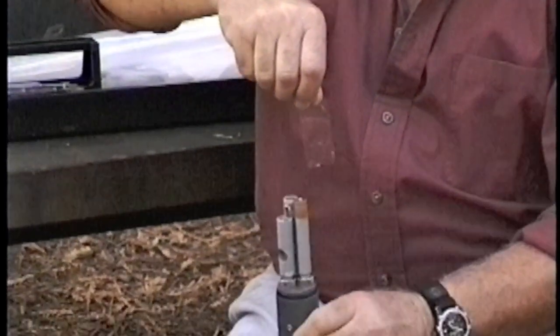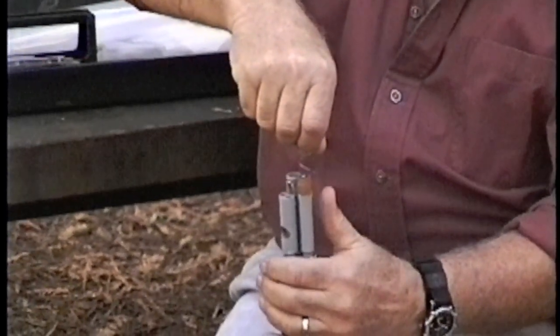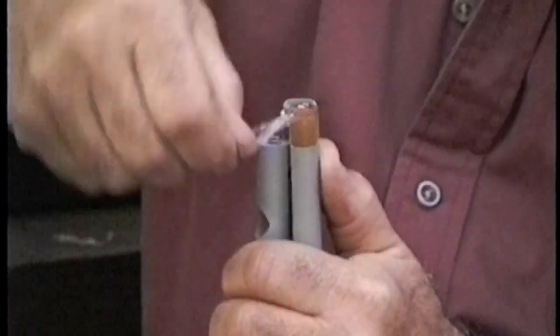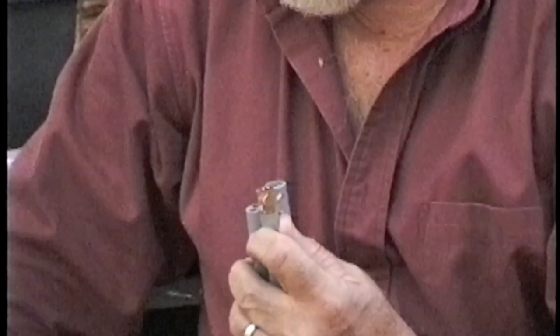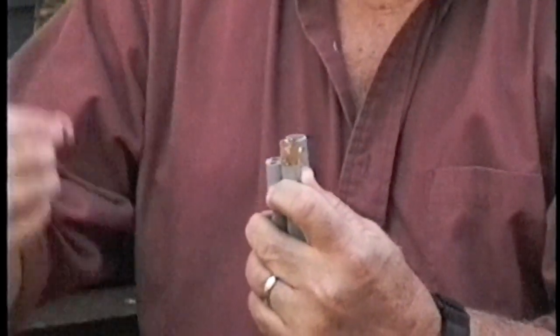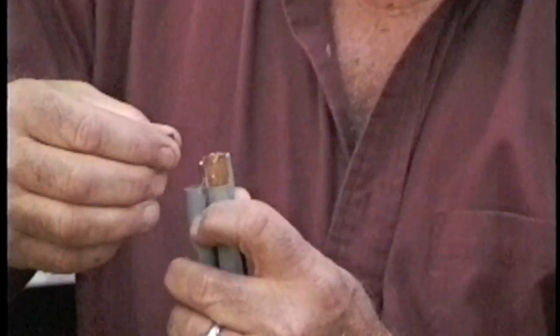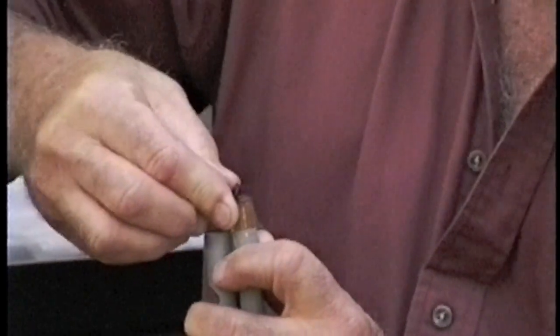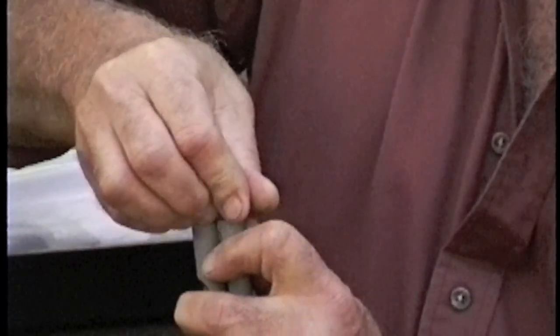You then put the membrane on the side of the probe, hold it down firmly with your thumb, and then stretch the membrane across the top of the probe, securing it with your other finger. Then, without again touching the surface of the membrane, roll an O-ring on with your fingers.